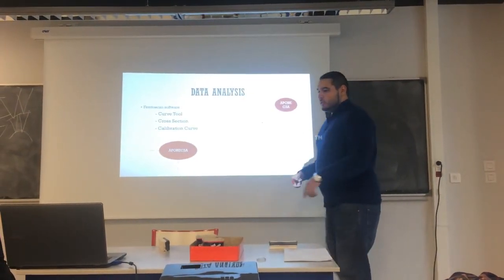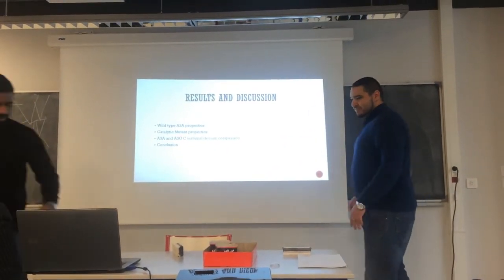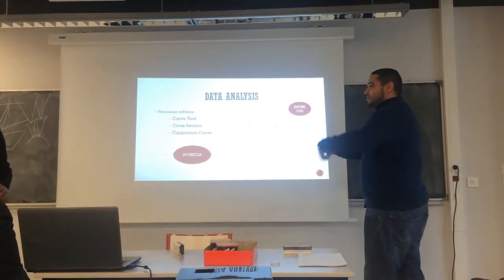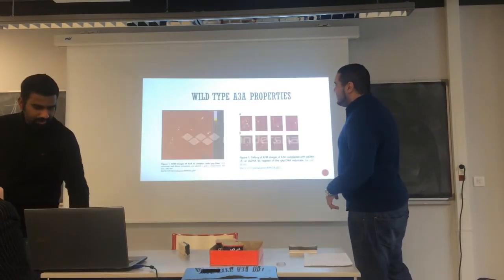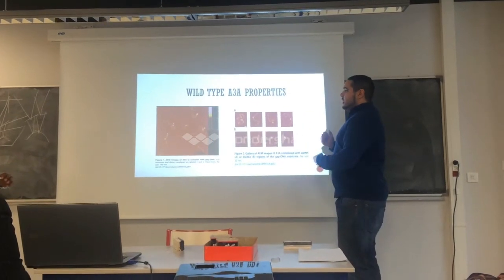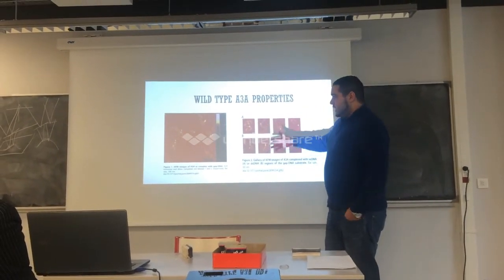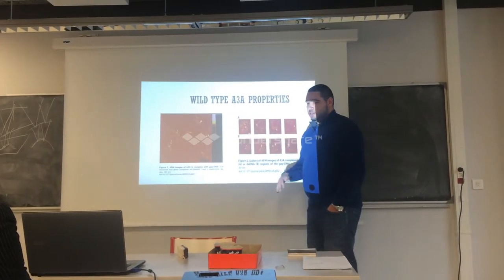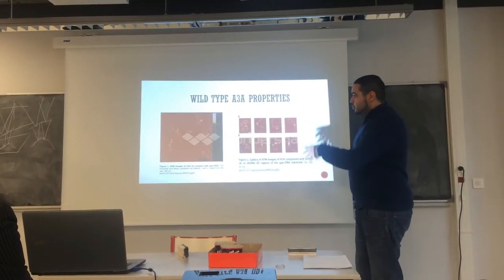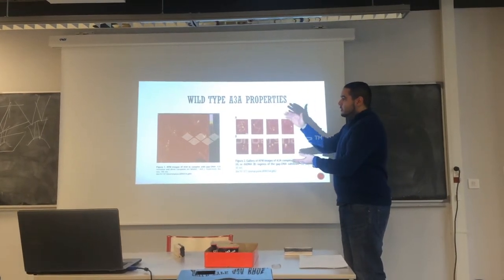The reason being is this is a standard image of AFM. The only thing you need to know about the images in AFM is that this gradient here represents the altitude of the protein or the complex, the altitude compared to the surface.